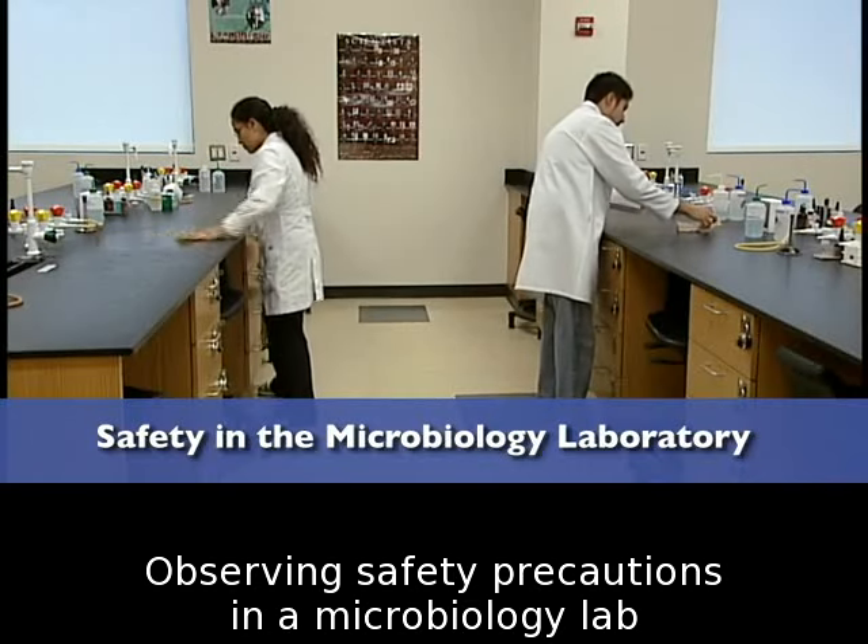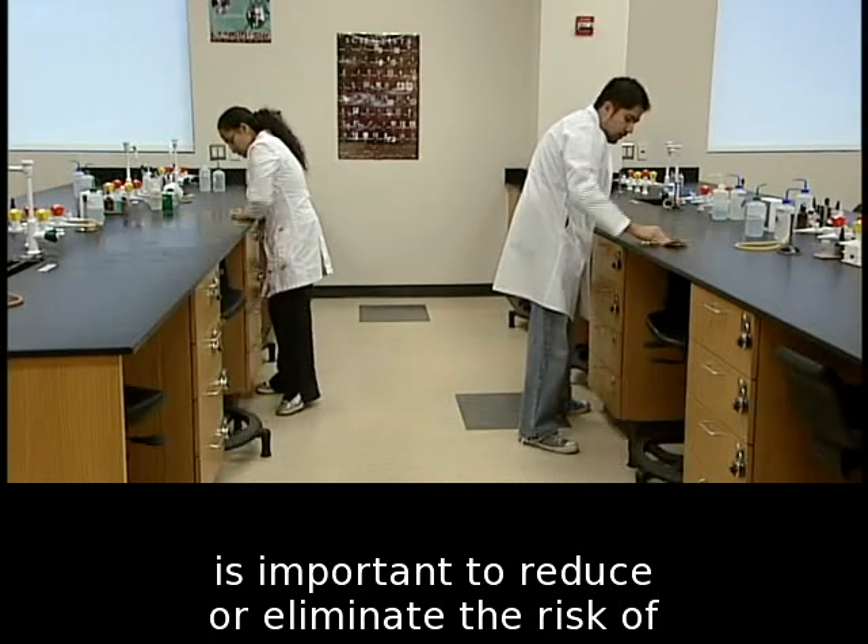Observing safety precautions in a microbiology lab is important to reduce or eliminate the risk of accidental infection and to prevent potentially harmful microbes from leaving the laboratory.